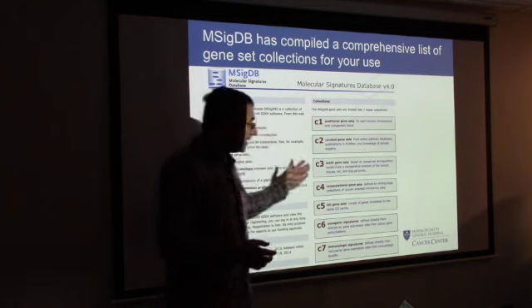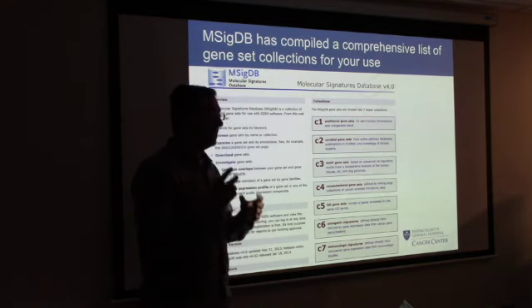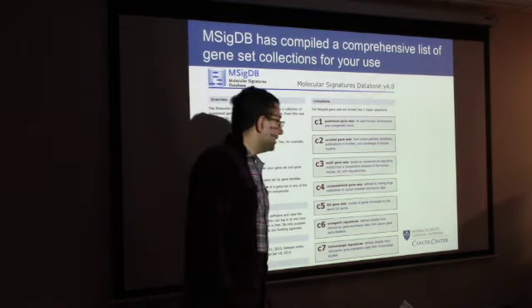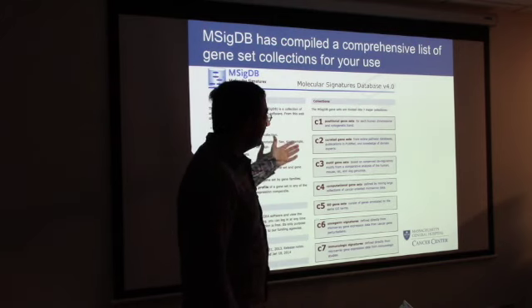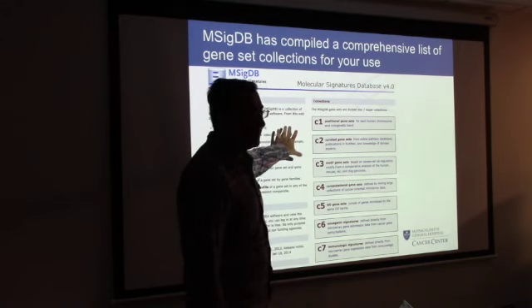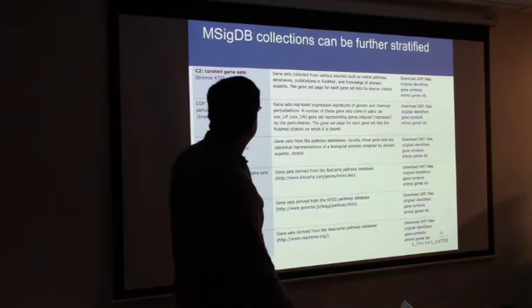So that's what I would recommend, but then that also means that you have to manually create your own gene sets. Does that make sense? So it's like a catch-22, but I figure once you understand this, you can try and figure this out, right? If you don't know anything, you can still go ahead and just run the basic GSEA, and that's still good. Okay? All right, so this is just a description of all of those things.